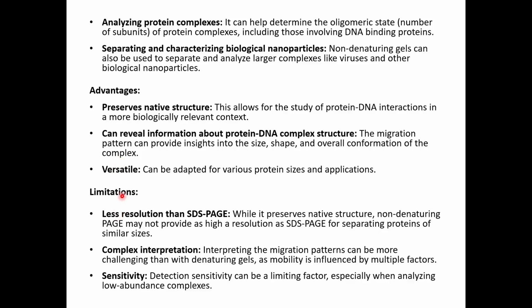Then it is versatile. It can be adapted for various protein sizes and can be modified for different applications, different experimental designs and setups depending on the nature of your complexes. Then it also has some limitations because it is a native gel. The resolution is less than SDS-PAGE. While it preserves the native structure, non-denaturing PAGE may not provide as high resolution as SDS-PAGE for separating proteins of similar sizes.